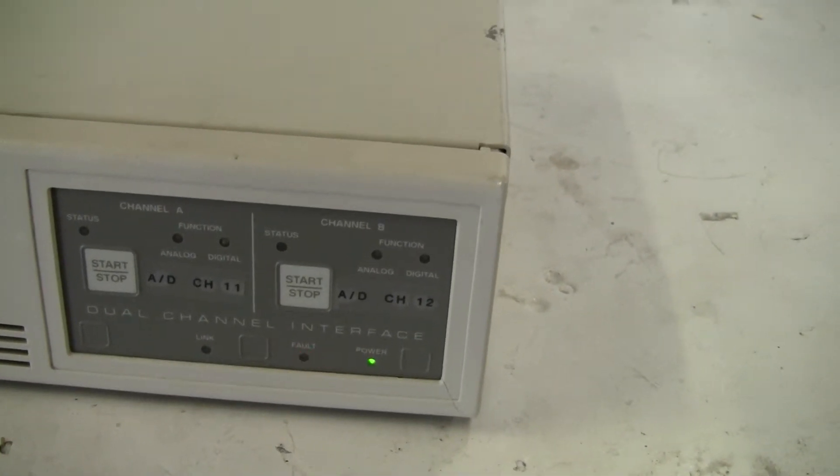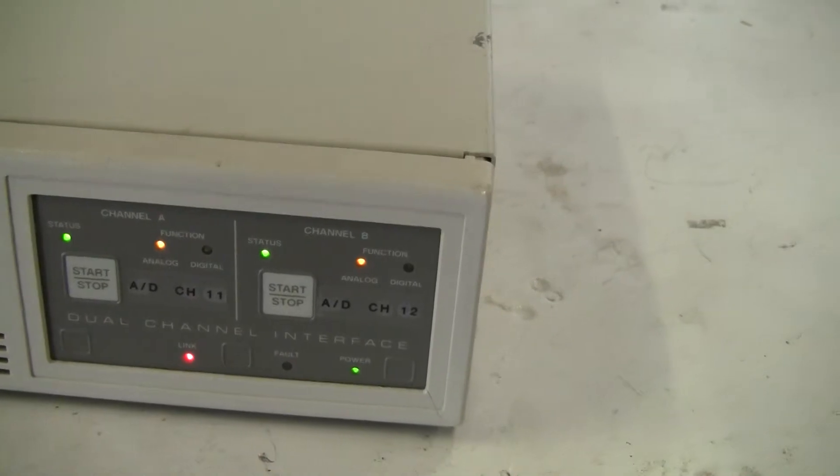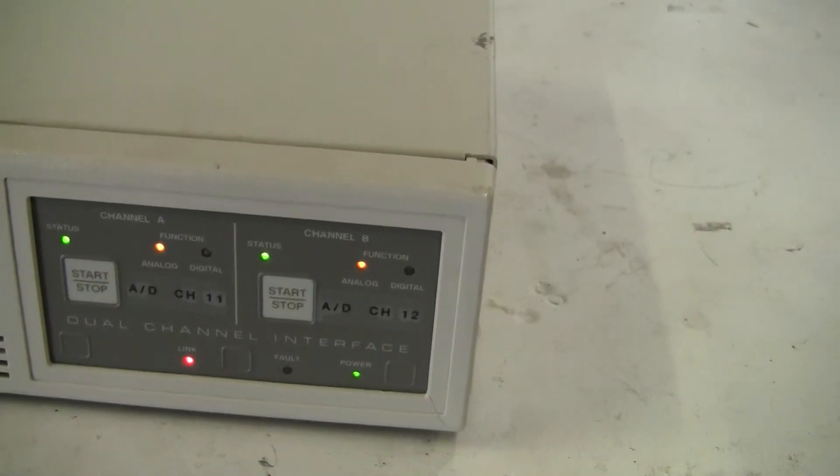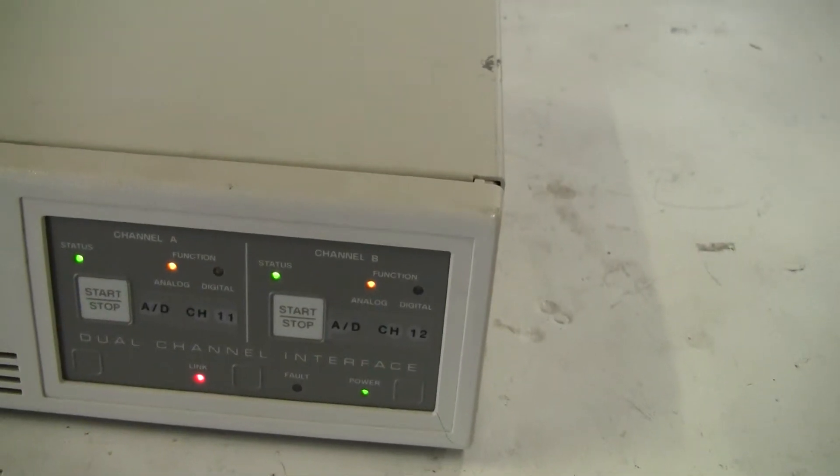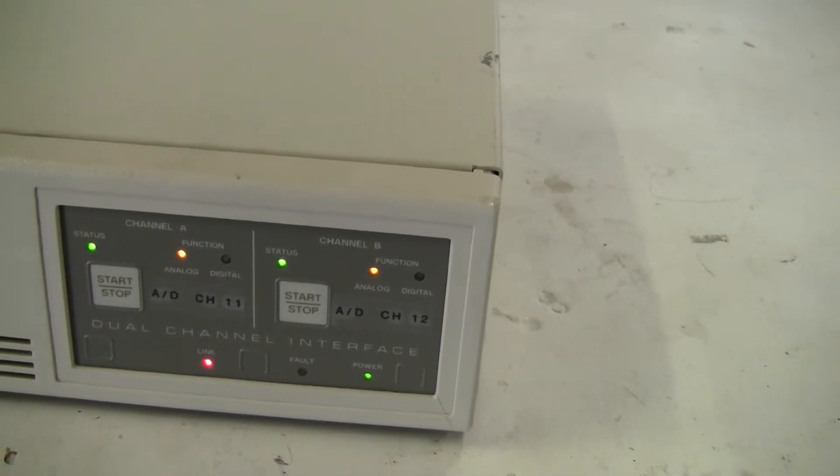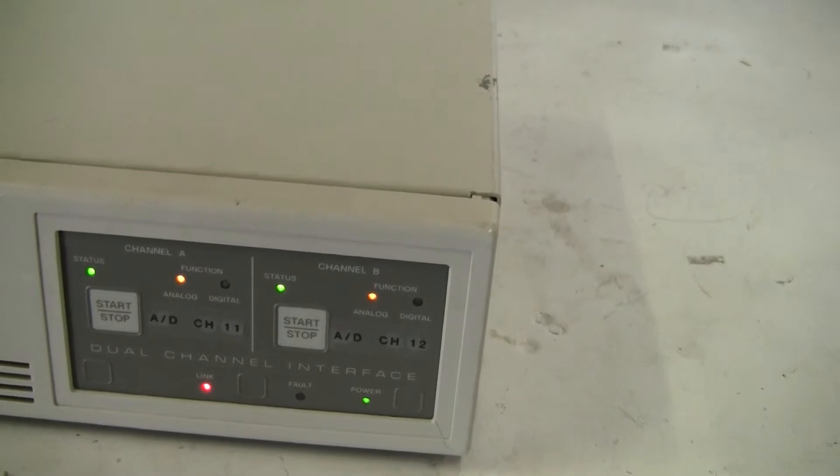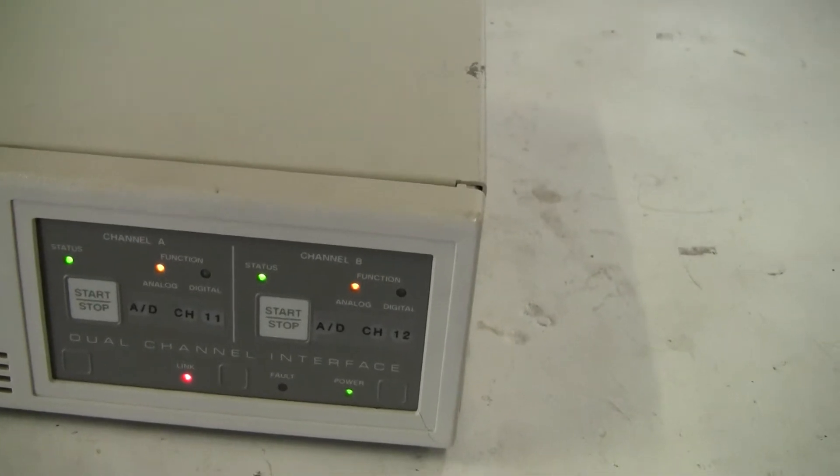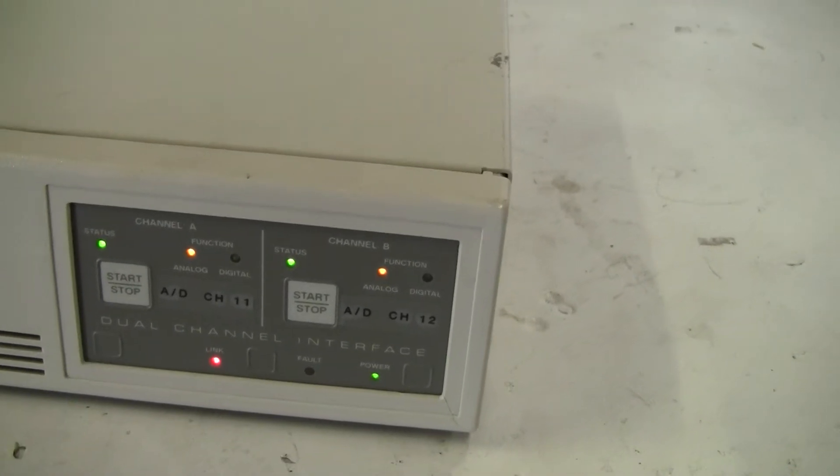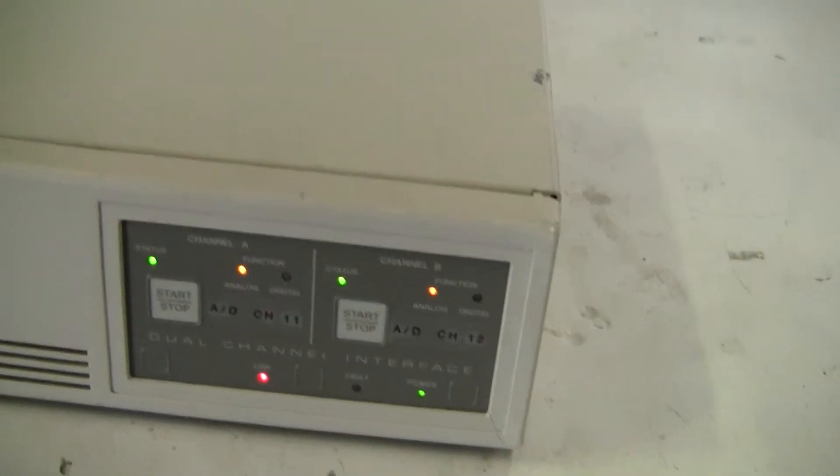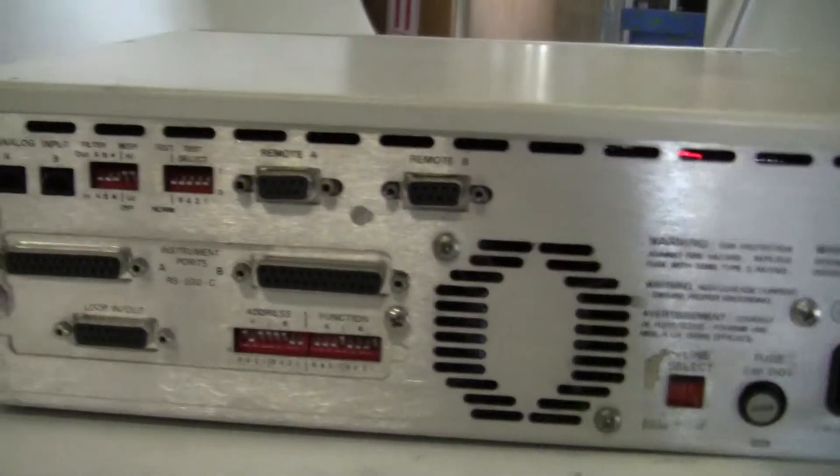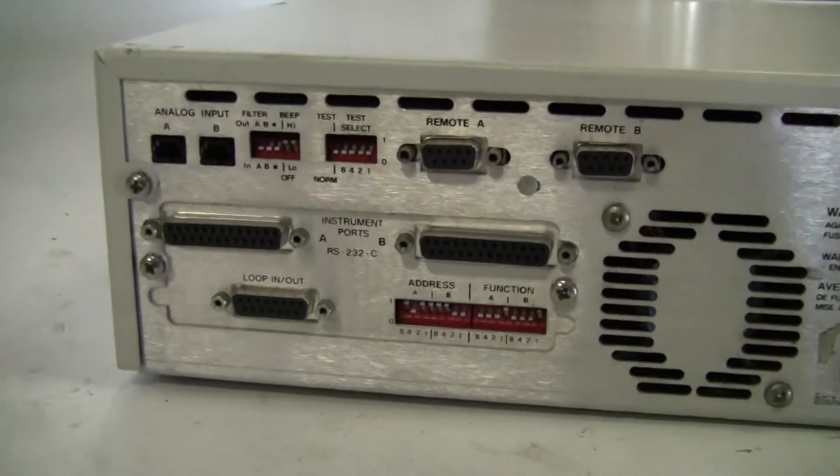It takes a couple seconds to warm up. That's pretty much what it looks like while it warmed up. Let's take a look at the back. There's the various ports.